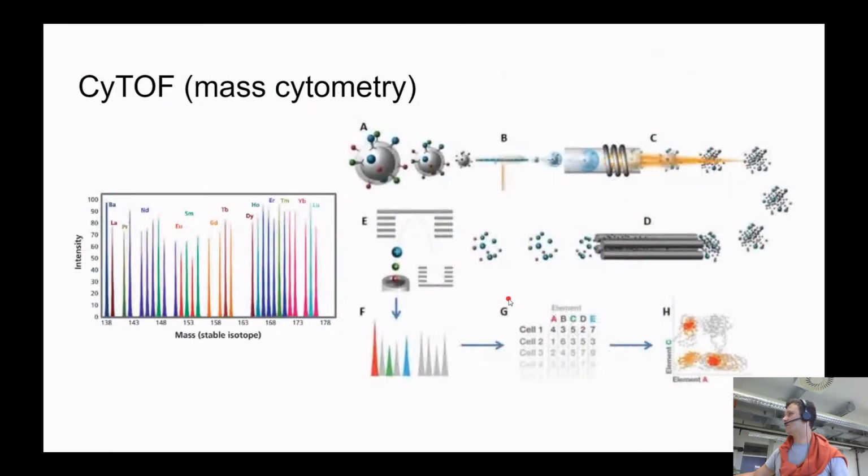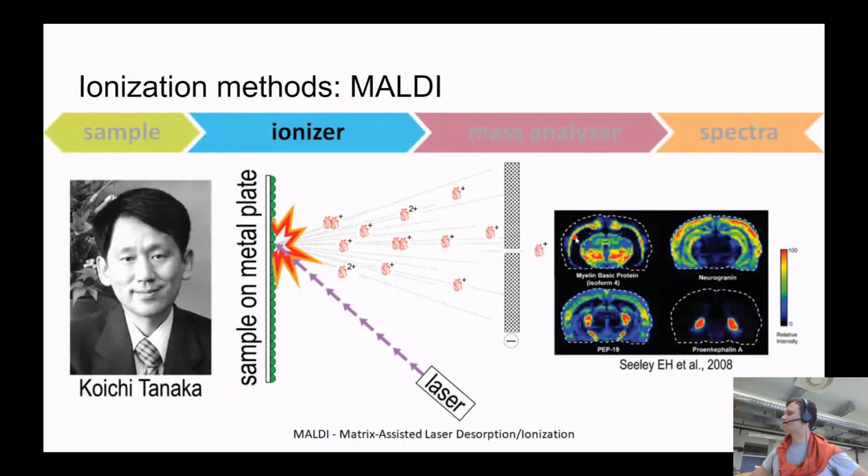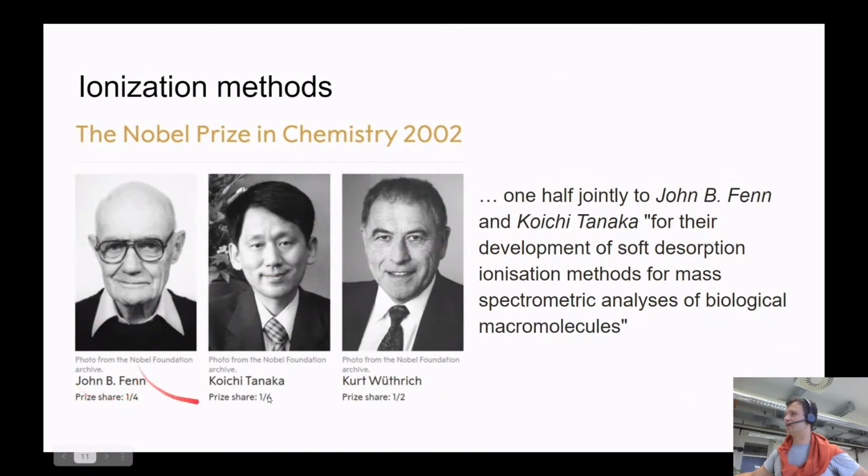So you see, something like this, it's like hot plasma. It was too hot, and it was fully destroying polymer structure, fully destroying all organic chemistry. This was not really feasible for manipulating polymers, understanding the sequence of the amino acids in the protein, etc. So of course there was no way to go. And these two scientists, John Fenn and Koichi Tanaka, came to two different methods to actually do this, ionizing and transferring from one phase to another phase. And we're going to discuss it briefly soon.